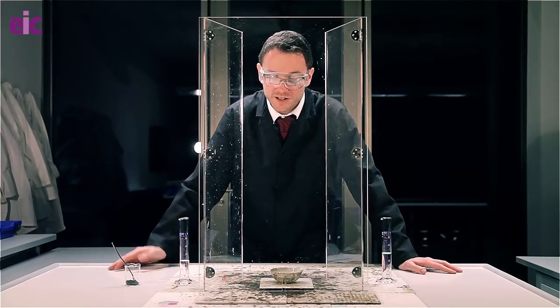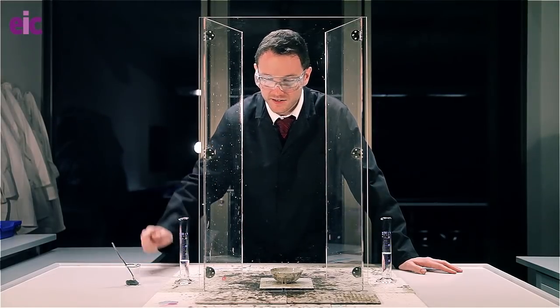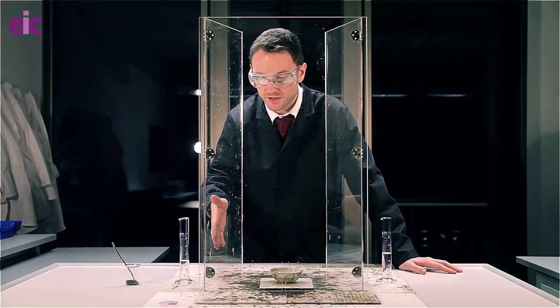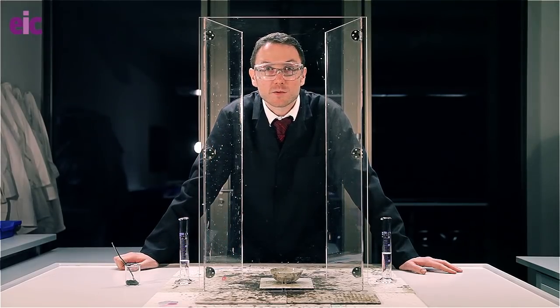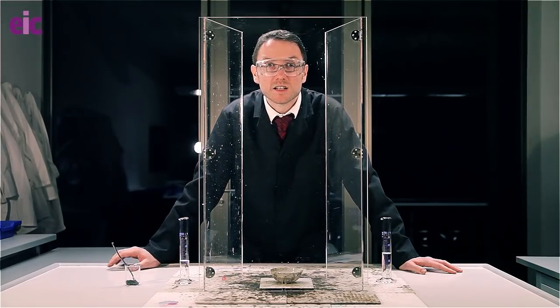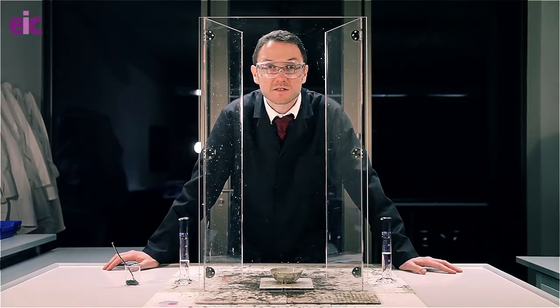I'm protecting the desk here with a number of different heatproof mats. I've actually made two layers thick around here to try and capture and cover up all of the gaps between the mats, and I've even got another tile in the middle. This is just because a fair amount of liquid has the potential to spill out as you're doing this demonstration.